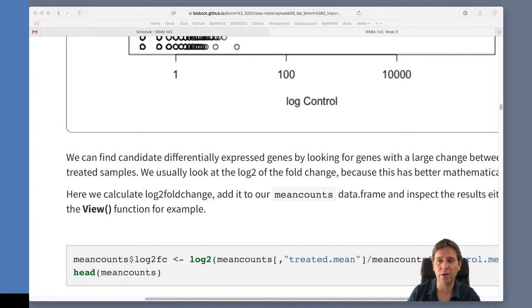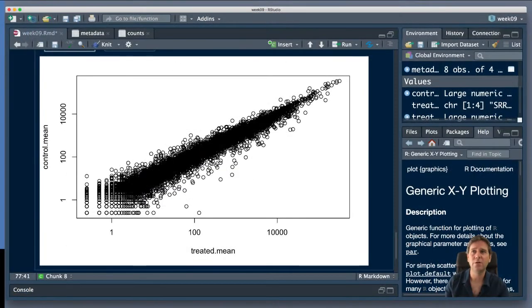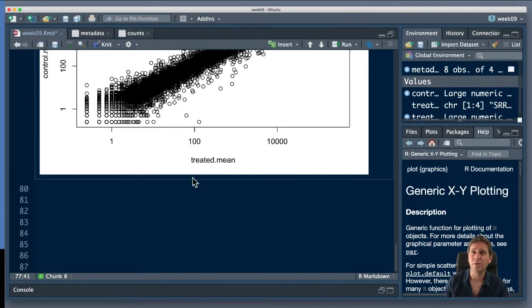So let's go back to RStudio here and do what we said, which, where am I? Okay, so store results to date in one data frame.